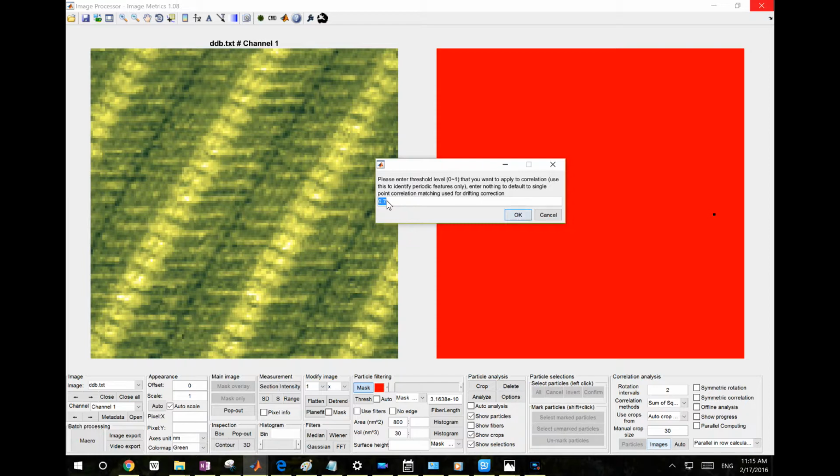A 1 will only match with itself, the template. If you use 0.7, it will match pretty well, the match should be of high quality. If you use something like 0.3 or 0.2, the match will be pretty bad, and you probably won't get a good enough averaged result.